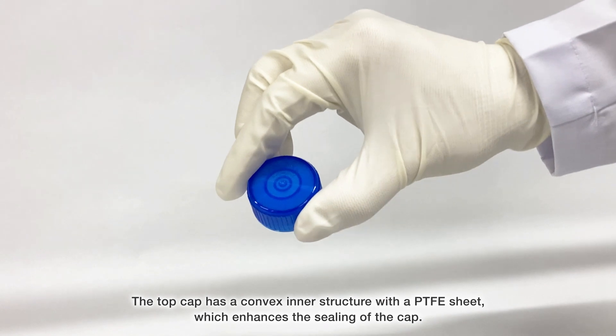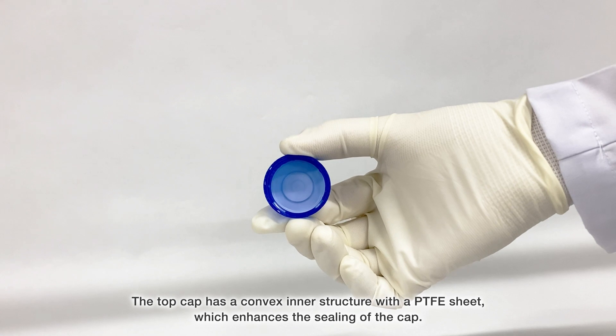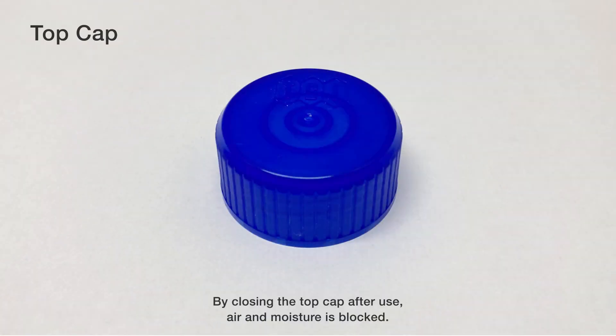The top cap has a convex inner structure with a PTFE sheet, which enhances the sealing of the cap. By closing the top cap after use, air and moisture are blocked.